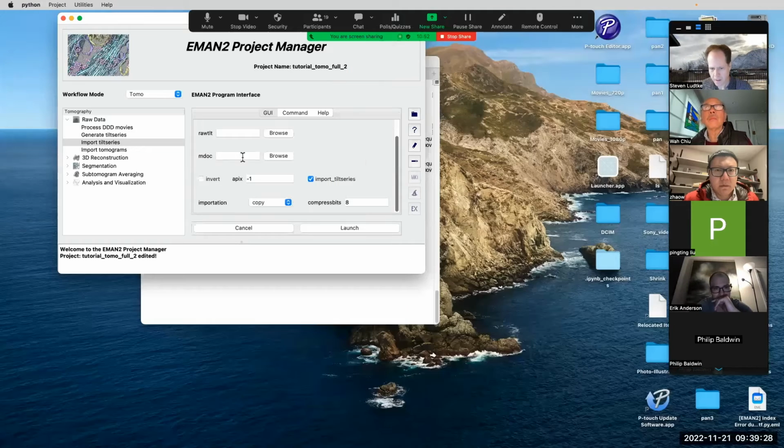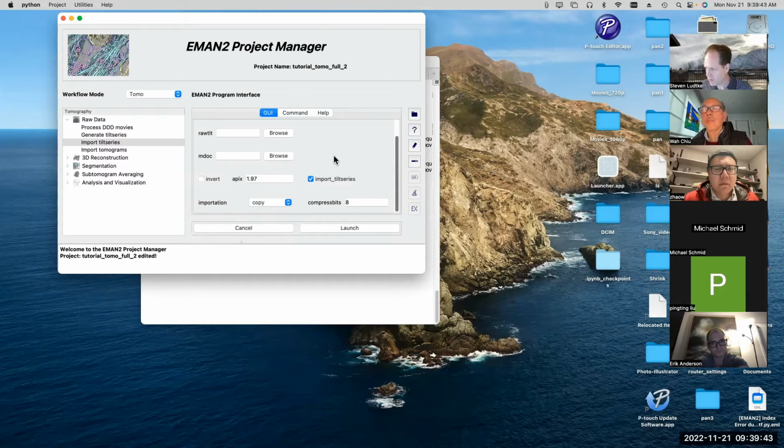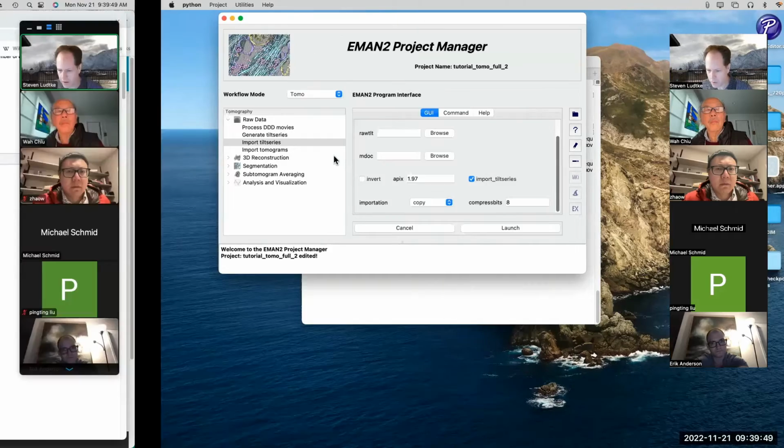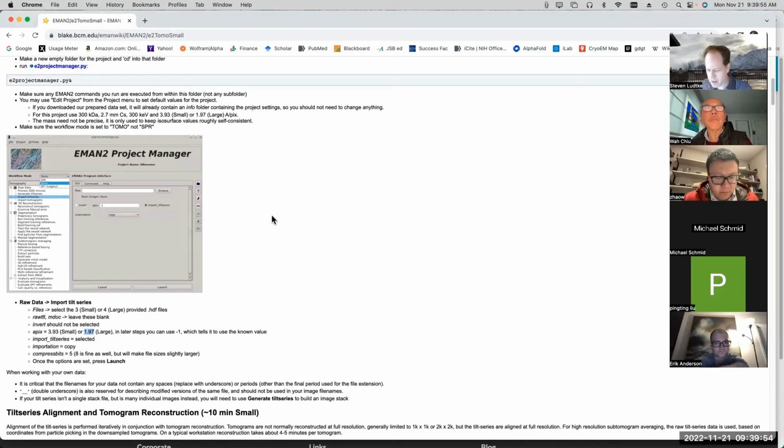Steve? Yeah. Hi. Do you work with at any point the raw frames, or are these assumed to be aligned by MotionCor2 or whatever? We assume that you've already processed your tilt series into a stack. We don't do anything with the raw frames directly here. Thank you. For a long time we did try to do our own sort of MotionCor2 style thing, but MotionCor2 works pretty well. The IMOD alignment also works pretty well. So we haven't gone back and done much with that recently.